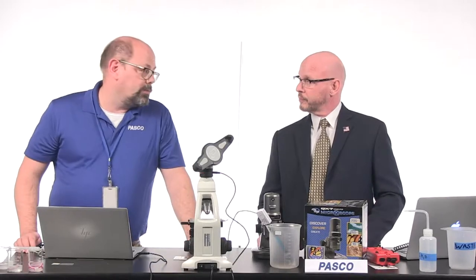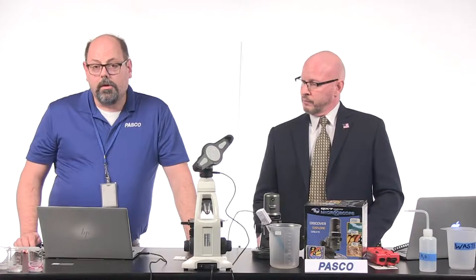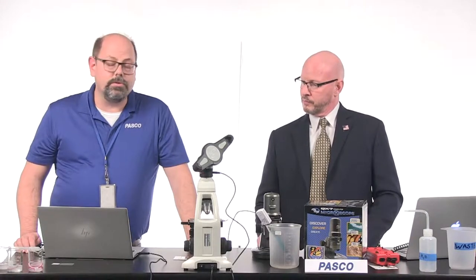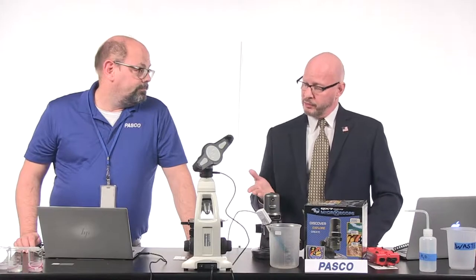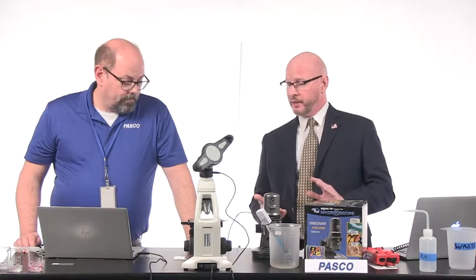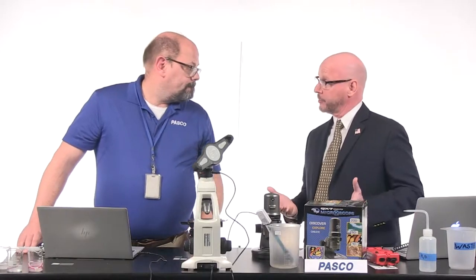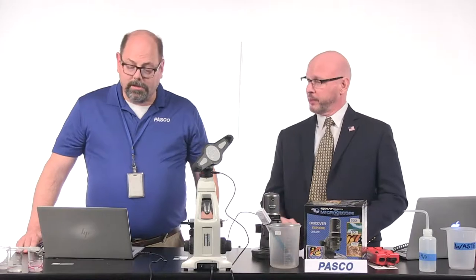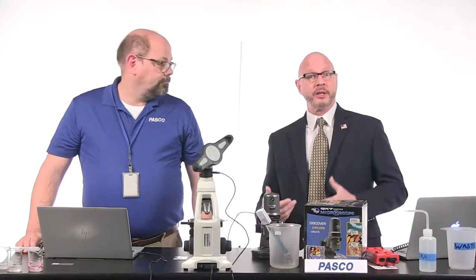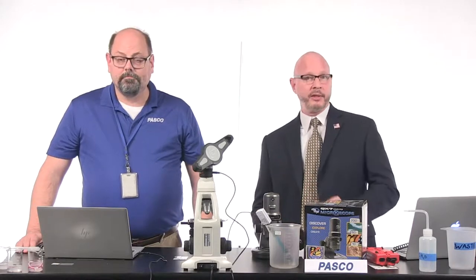But all of those would be great support pieces for teachers as you're making more of a lab and exploratory experience for students using cells. And in this case, you had the two prepared slides, one of the, I guess, more of a dry onion. And after a period of time, you should be able to go in and see the measurements. I'm going to guess that the cells are going to expand and become larger, and we can measure that within the software itself. And so we've actually communicated some great information about the cell structure, and the ability to measure.